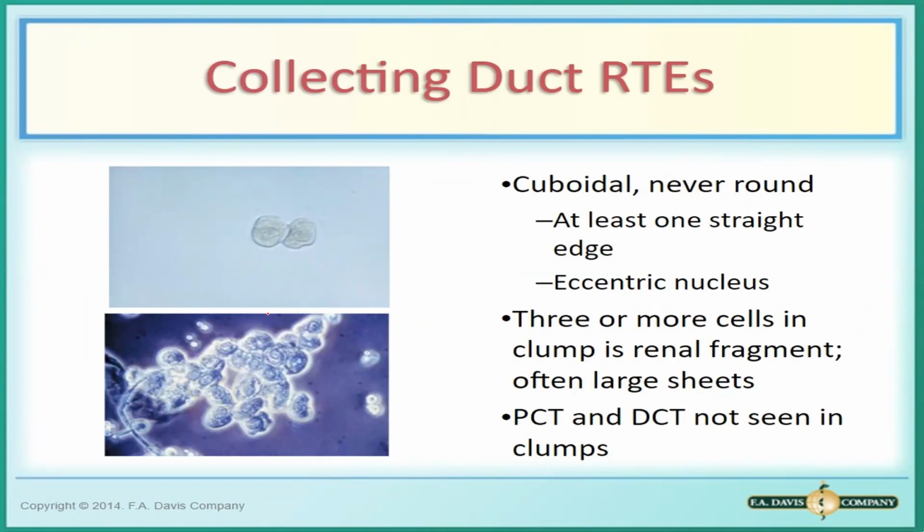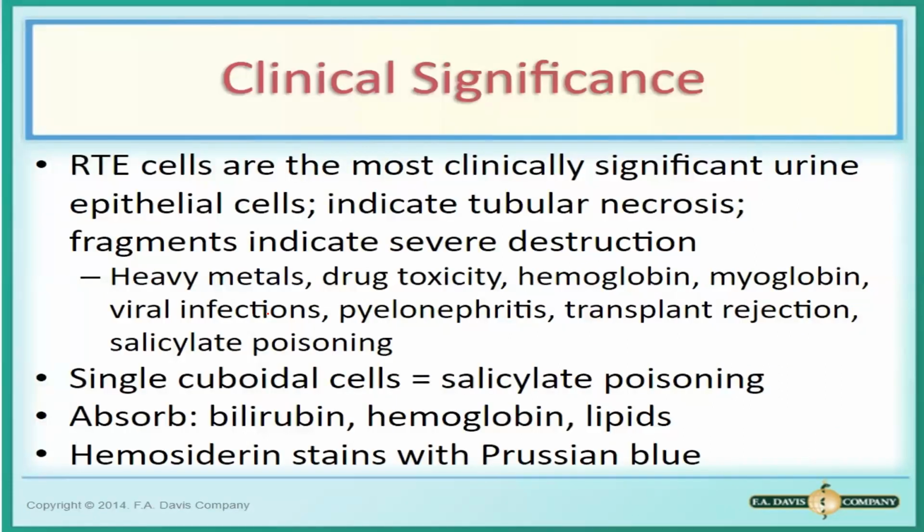So, in the Philippines po, or routinely here in the Philippines, depende sa laboratory, pero so far na napuntahan kong laboratory, hindi na namin ina-identify if anong type ng RTE. Basta RTE cell lang yung nire-report namin in general. So, clinical significance ng RTE cell.